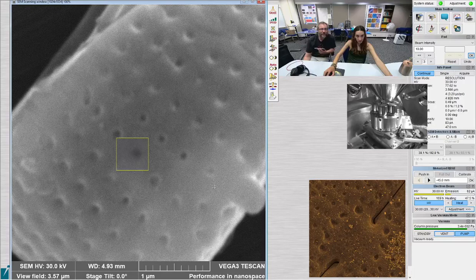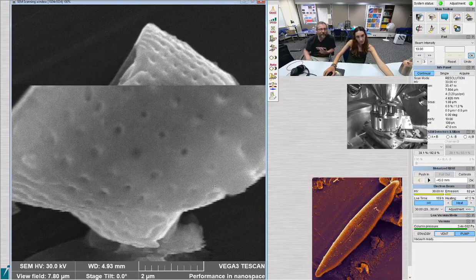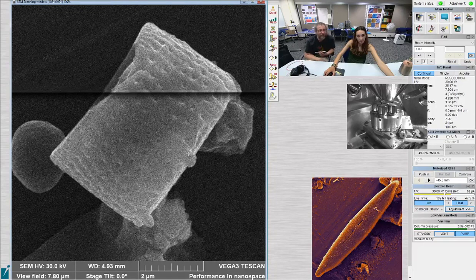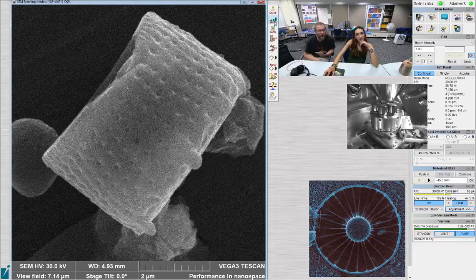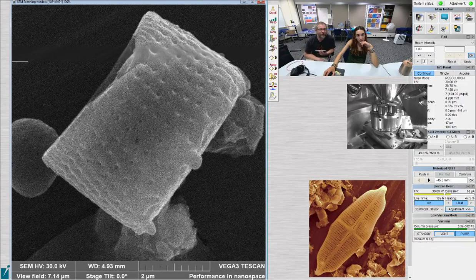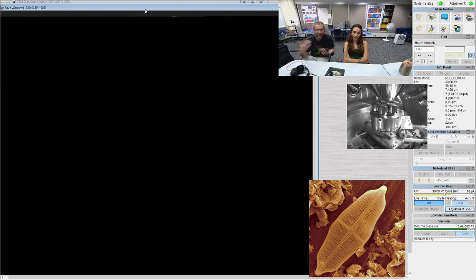So he's gone through and looked at them in the light microscope already. And in some cases, he knows what he's looking for, what we've seen. In some cases, he doesn't know, you know, we might come across something he hasn't seen. But they've got several years worth of collections from the same site because they have this as part of a course. And every year the class goes out and collects some of this diatomite material from the site. And then he just has that collection.